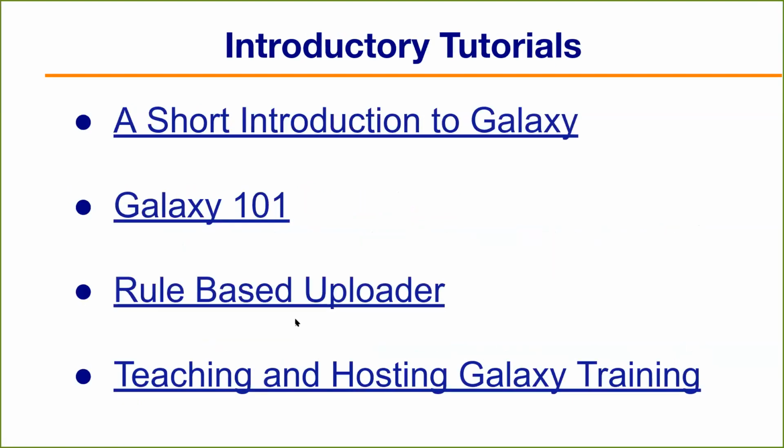Okay, so I'm going to switch gears now from these slides to doing some Galaxy tutorials. I've linked them in the slides, and I'm just going to skip past a little bit because I might run out of time to talk further about the slides.